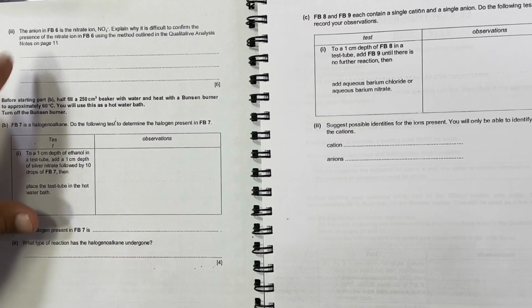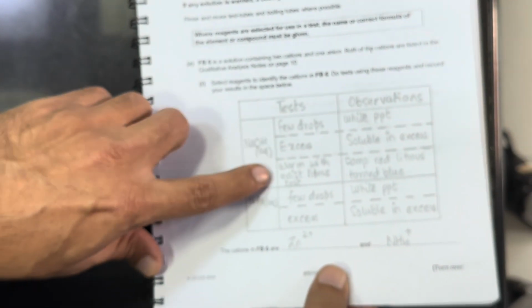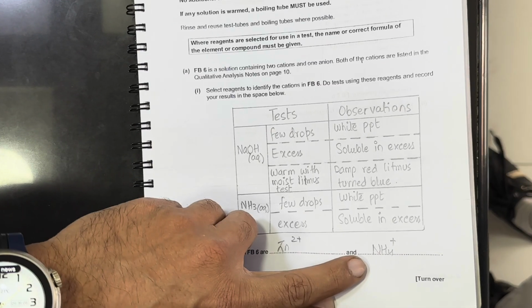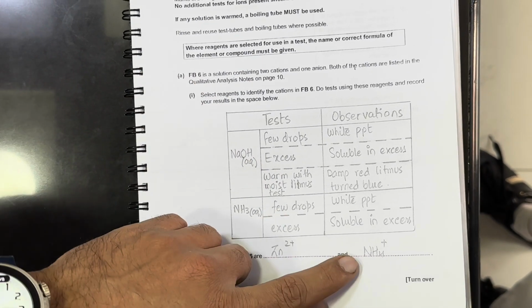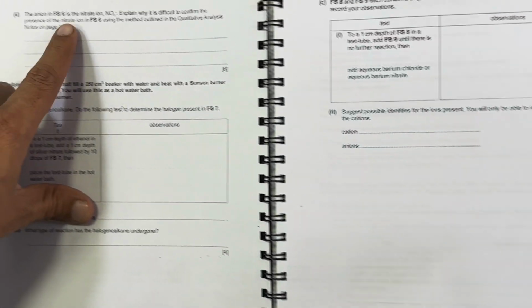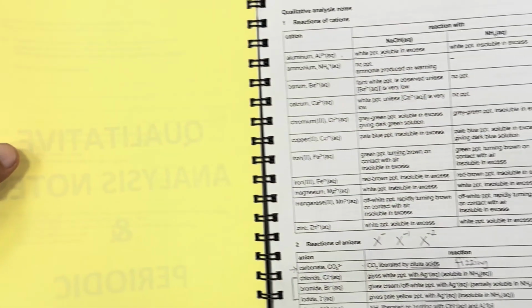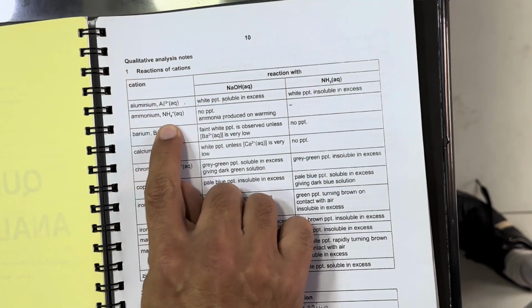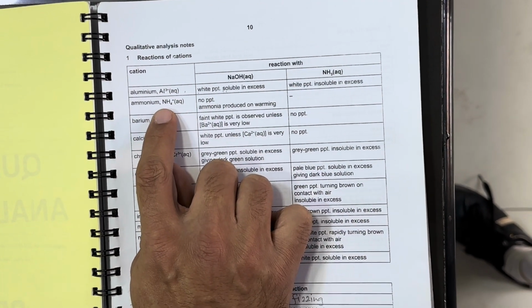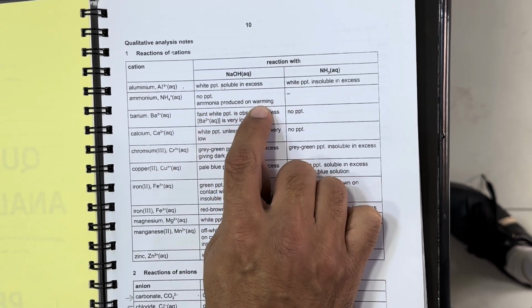Now if we see FB6, we have found it contains the ammonium ion also. FB6 contains a cation, that is ammonium, and it contains nitrate. Here they have said it contains nitrate. So now let's look at both tests in the qualitative page. The test to see the presence of ammonium ion was basically that sodium hydroxide was added and we have warmed.